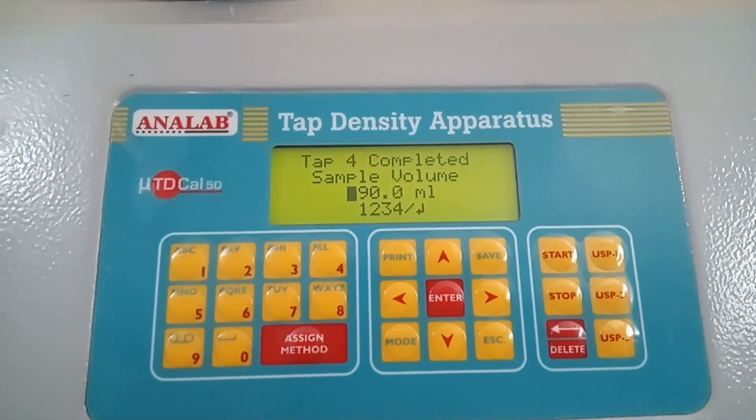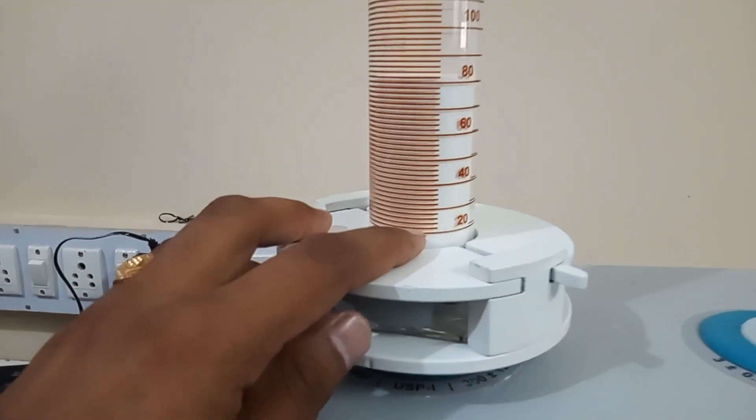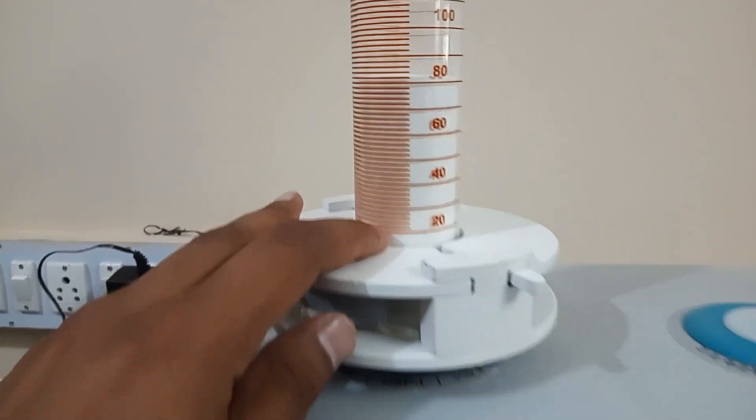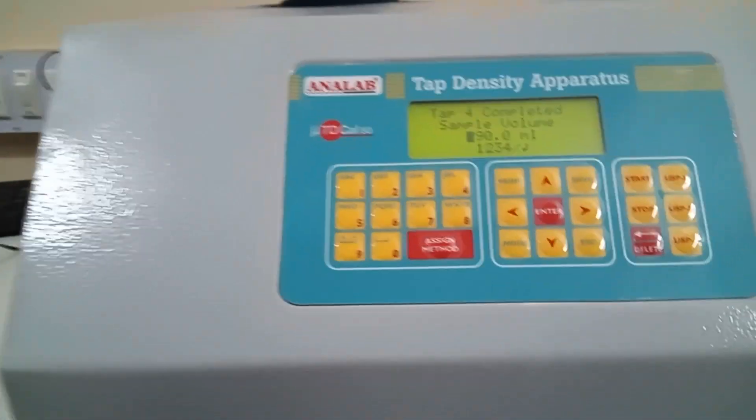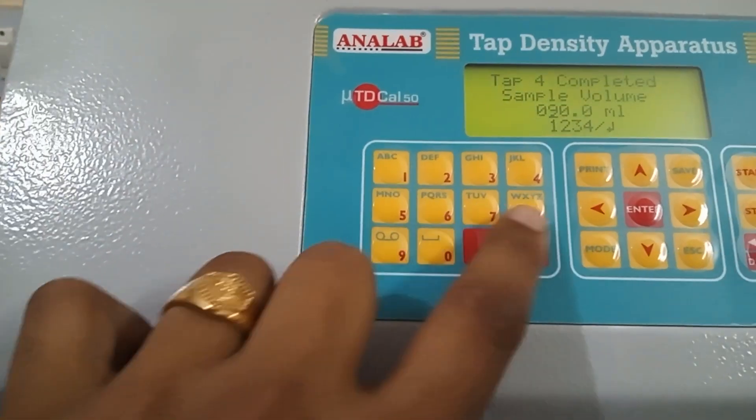So now the instrument is asking for the sample volume. It is somewhere around 85, so I will mention 85 ml.